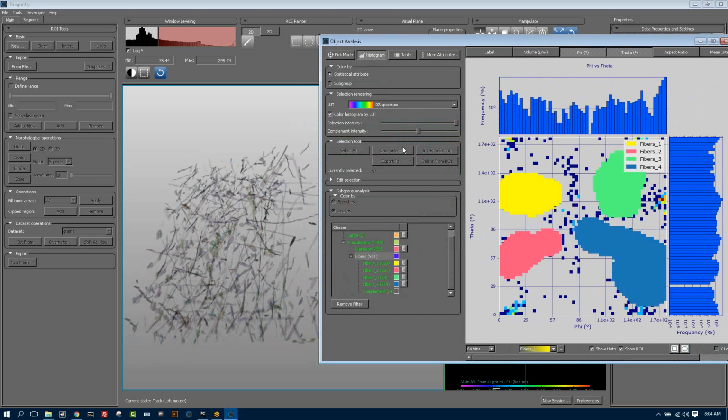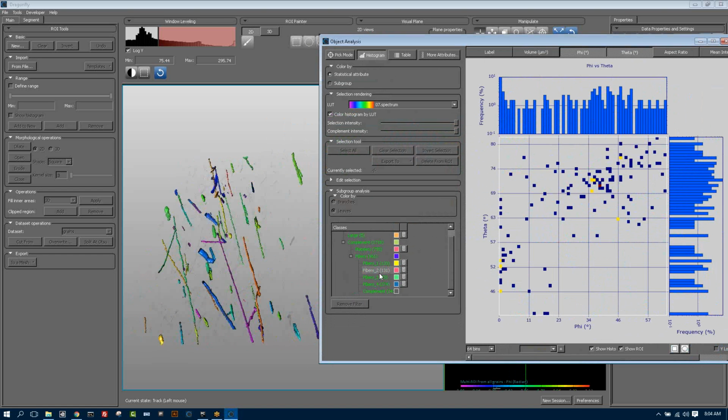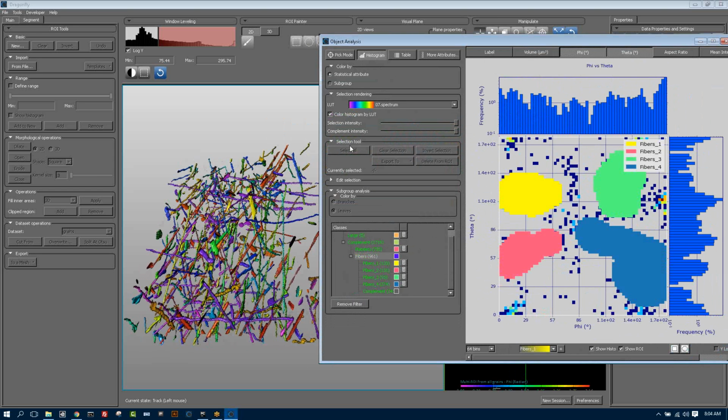And recall that anything that's not selected, you can increase the opacity just by dragging that slider. So here we are looking at any of these fiber groups colored by volume. Okay. So that gives us most of what we wanted to look at today for the objects analysis.